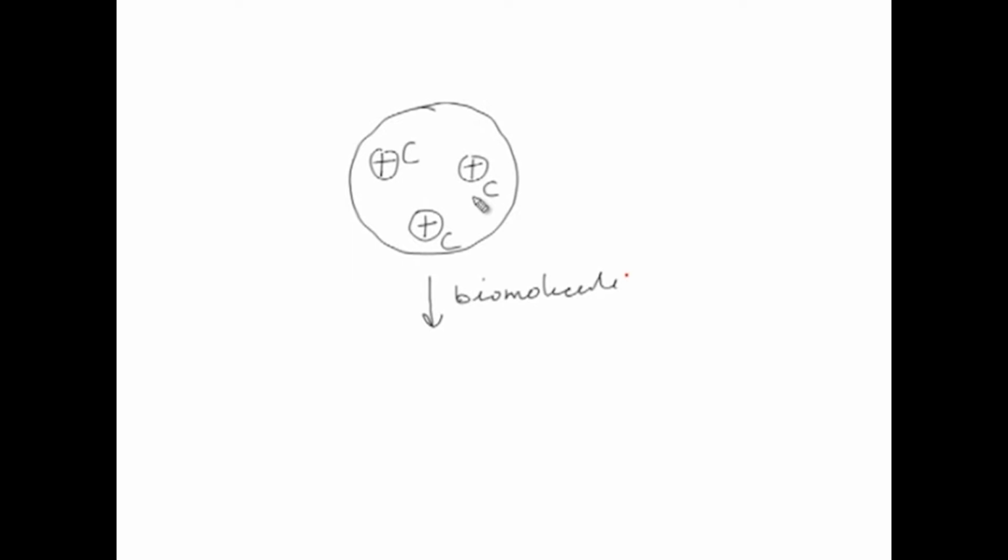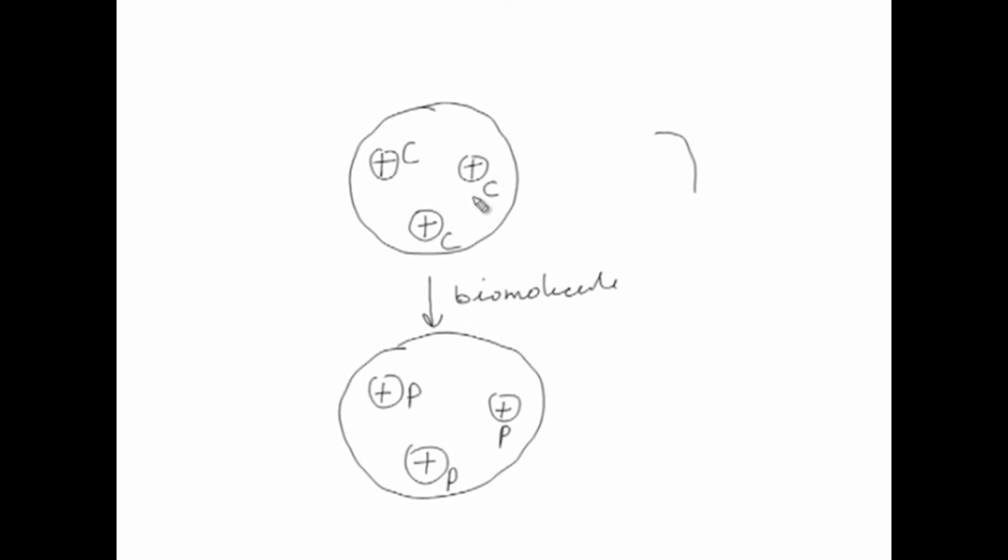They will replace the counter ions, and they can replace them because they have high affinity for the resin. So, protein molecules carrying negative charge will bind in here.